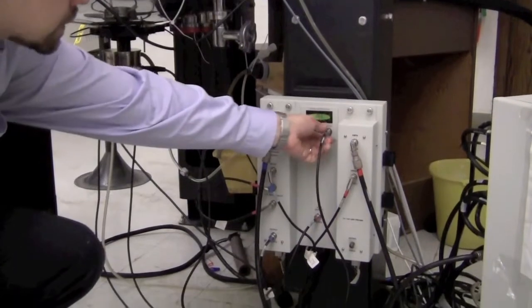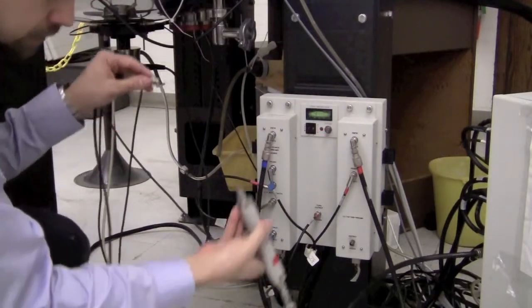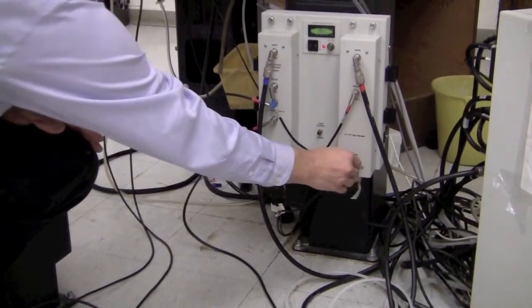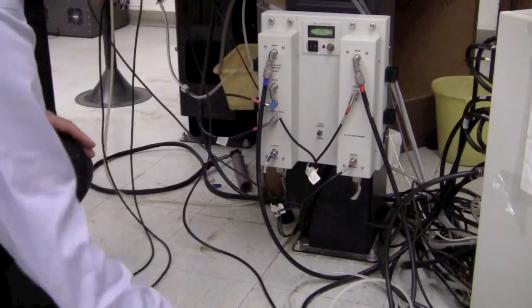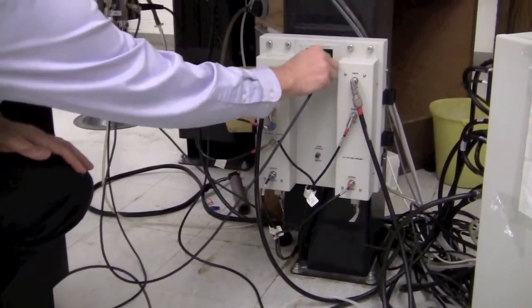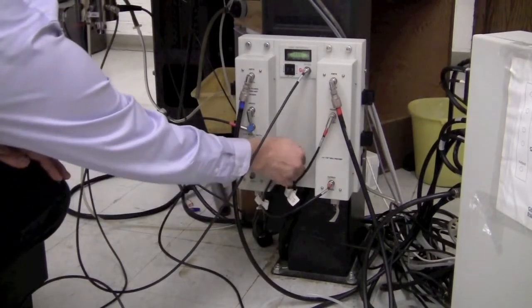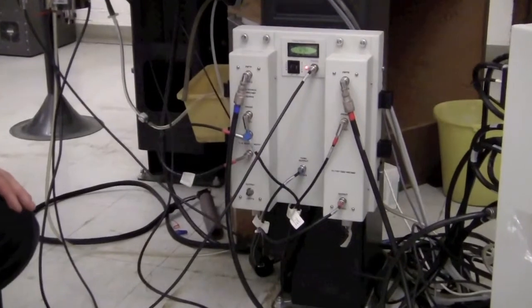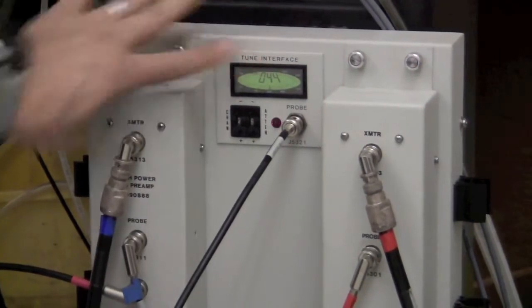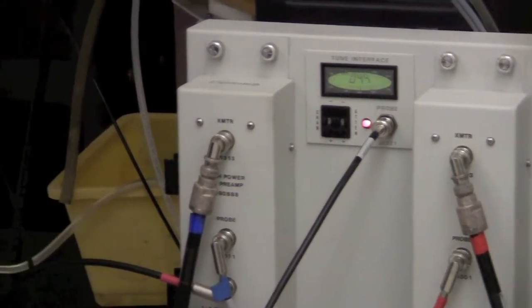To tune the carbon channel, change the cables. Put the proton cable from the probe back on the proton channel, and put the tune output back on the proton channel output. Then take the carbon channel probe and put it on the probe connection for the tune interface, and take the carbon channel output and put it on the tune output. Change the channel to number two, as set in the software. The tune interface now shows a value like 44. Go to the carbon tune and match knobs and start with the match, trying to minimize the number.